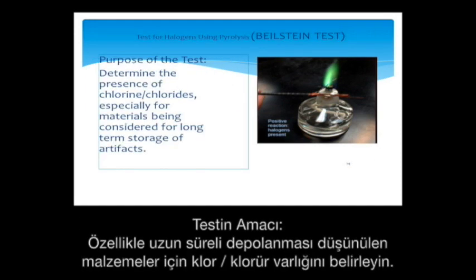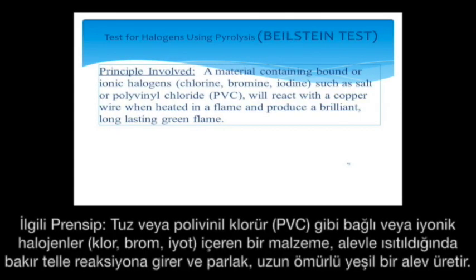The purpose of the test is to determine the presence of chloride, especially for material being considered for long-term storage of artifacts.